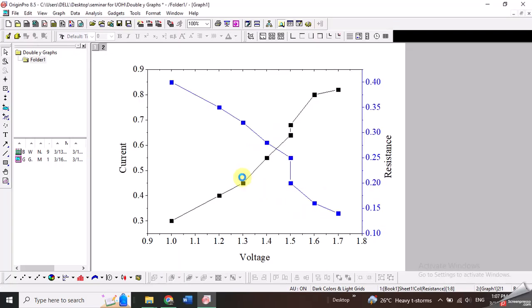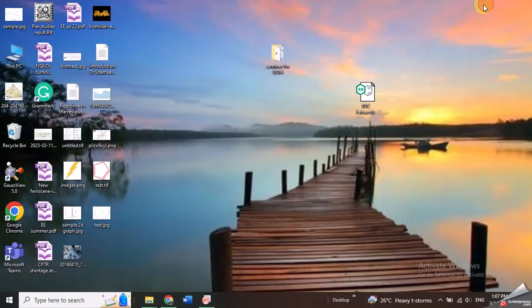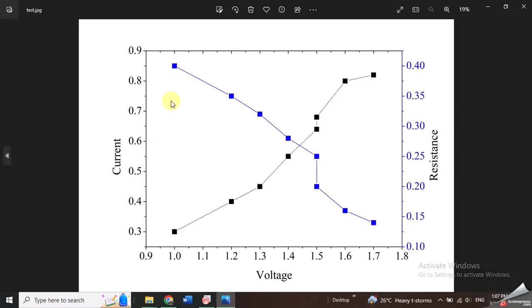And when I click OK then the image file of this Origin graph will be saved. And I can go to my destination and see if the image has been created or not. If I open it I can see that the Origin graph is converted into the image.